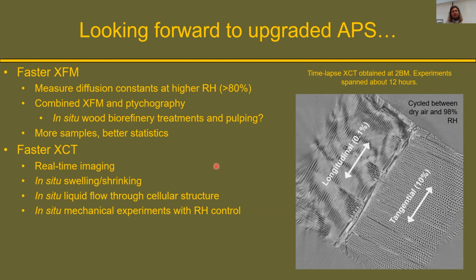And so, if we get some combined structure information, that could be really valuable for us. And of course, more samples and better statistics. In terms of XCT, going towards real-time imaging, like was mentioned earlier.